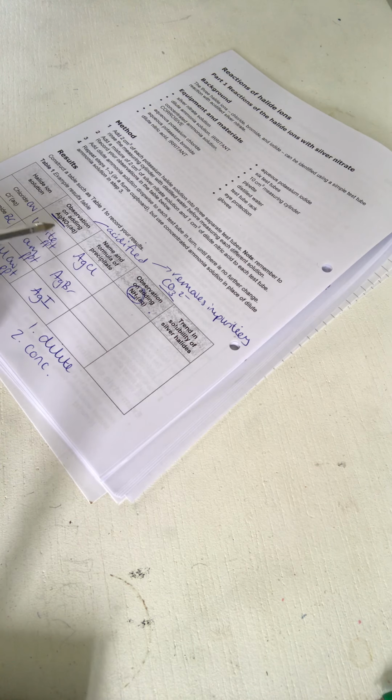Well, the point is that actually these are all quite similar colours. White and cream could be mistaken for each other. Cream and yellow potentially could be mistaken for each other. White and yellow perhaps not so much, but they're similar. It's a subjective test. So that's the reason for this second part.